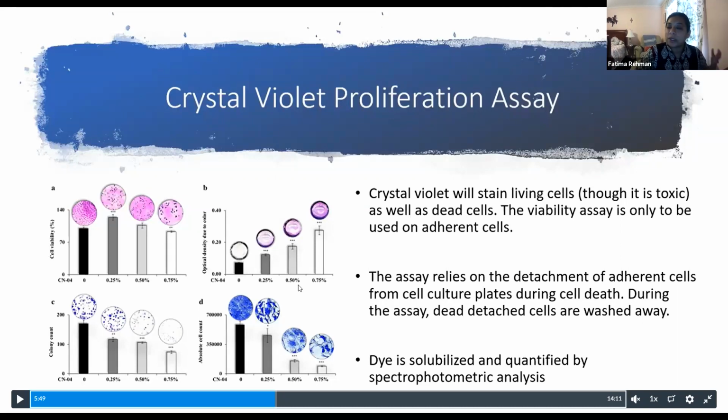So I thought I would show you some examples. One thing you may see is images of cells grown in culture, either individual cells or colonies of cells. Especially with cancer cells, we can do an assay called a tumorogenicity assay, where we embed the cells in a little agar medium.